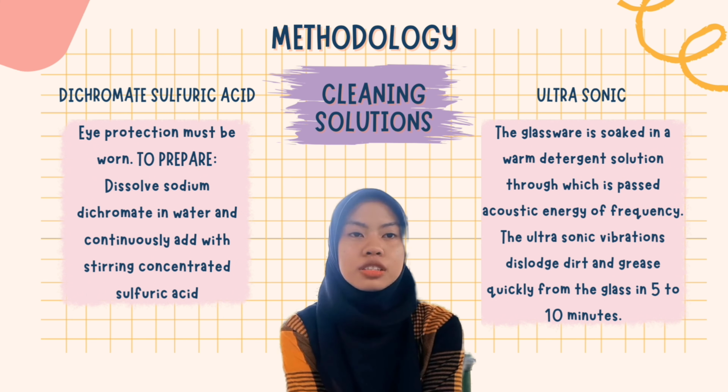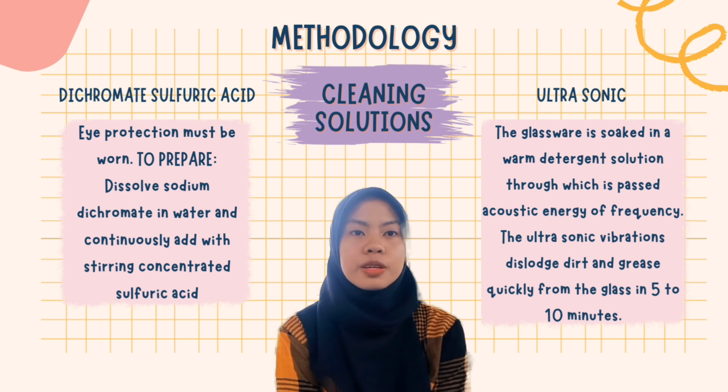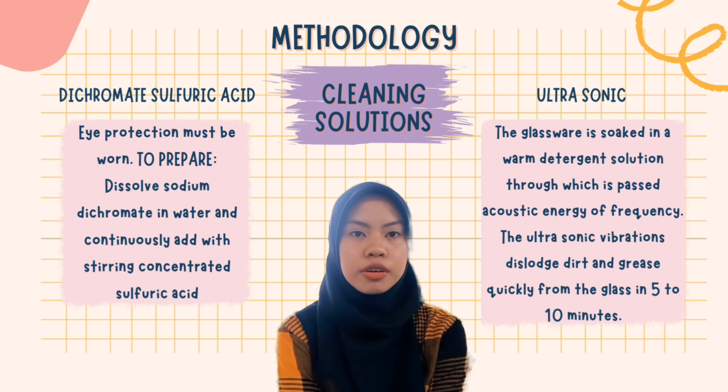The last one is ultrasonic. The glassware is soaked in a warm detergent solution through which is passed acoustic energy of ultrasonic frequency. The ultrasonic vibrations dislodge dirt and grease quickly from the glass in 5 to 10 minutes.